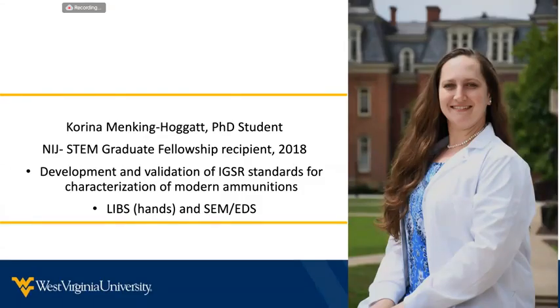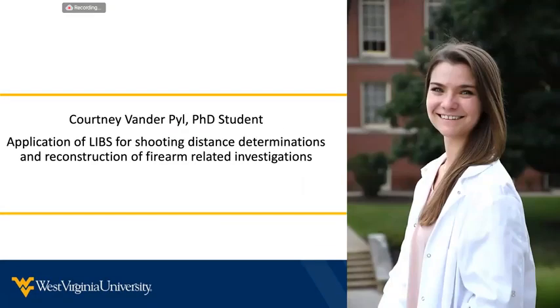She is the recipient of an NIJ STEM Graduate Fellowship for the development and validation of inorganic gunshot residue standards for the characterization of modern ammunition. For what we are going to be discussing today, Corina helped a lot in the development and validation of the LIBS methods for the detection of gunshot residues on hands and the SEM-EDS analysis.